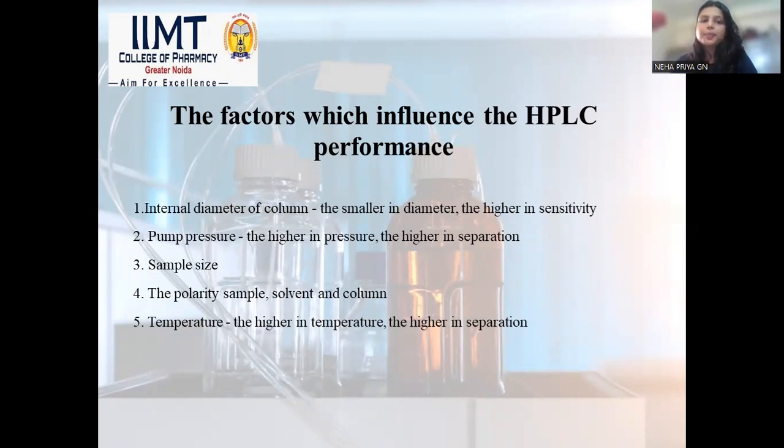The second thing is pump pressure. The higher the pressure, the higher the separation. So we need to take care that there is high pressure within the pump, and there needs to be no variation within the pressure, because that will affect our result. Third is sample size, and in HPLC, we have to use HPLC grade materials only. So this is also one of the factors where the HPLC result can get influenced.